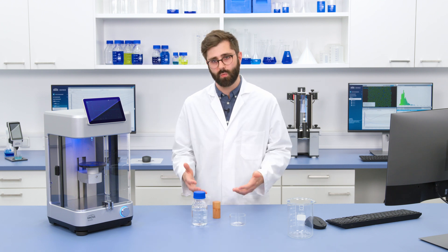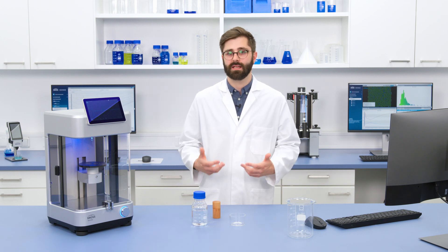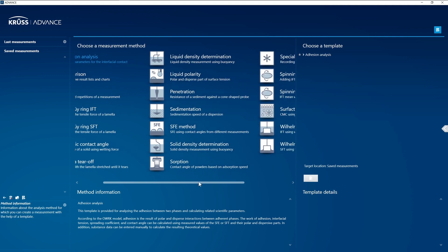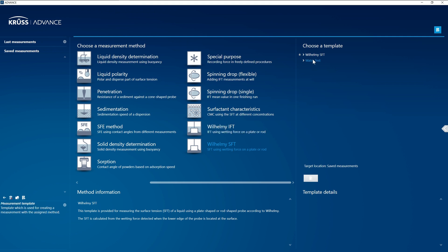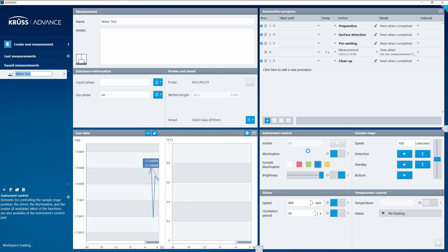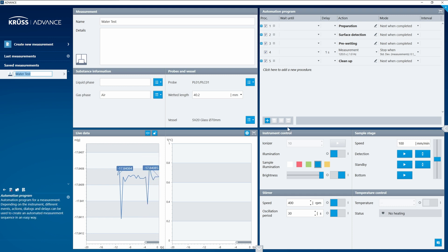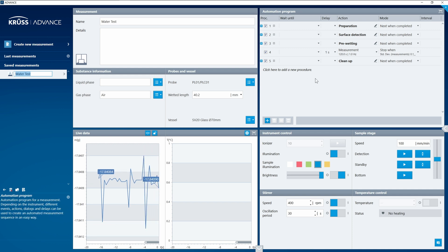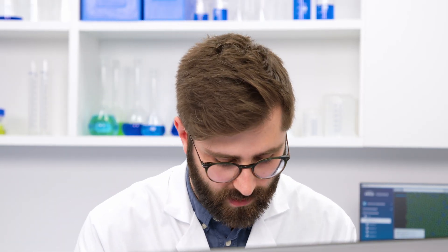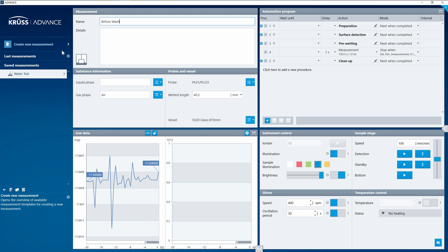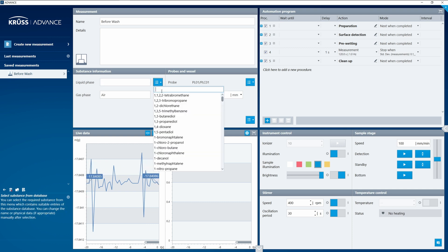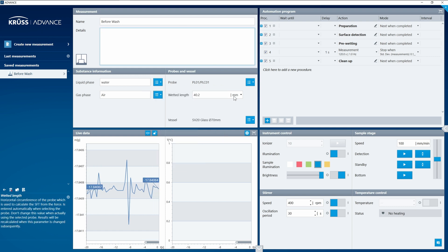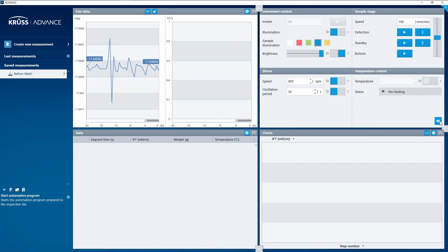To do this I first need to check the surface tension of my pure water as a reference. I take some water and move over to ADVANCE to open a surface tension measurement. I select surface tension and open up my predefined water test template. Once in the measurement method, everything has been pre-programmed, so I just need to give my measurement a name — in this case I'll call it 'before wash' — and tell it what liquid I'm testing, so I search for water. Everything is set up; I just scroll down and press the start automation button.